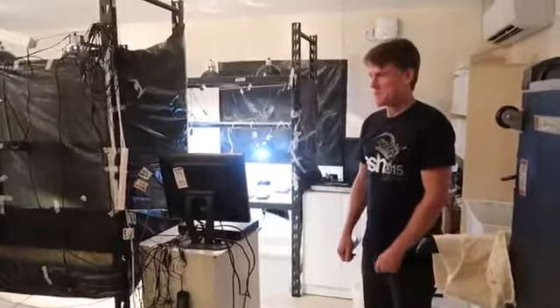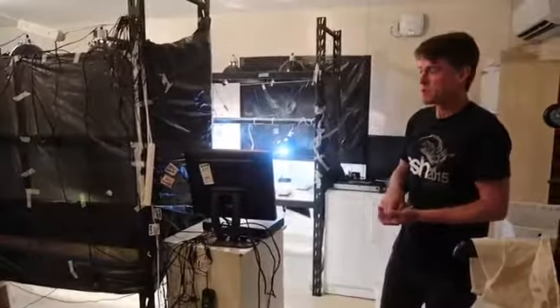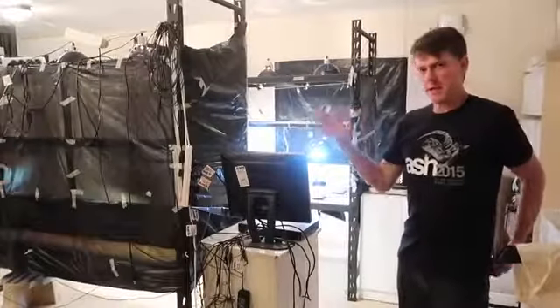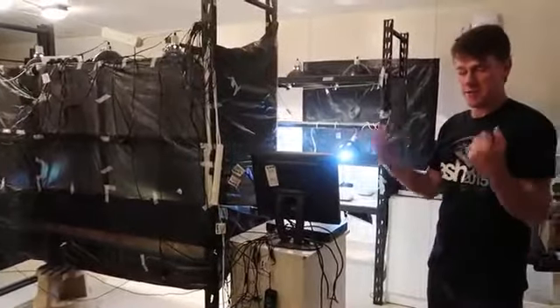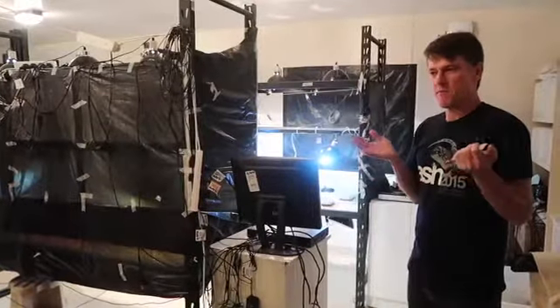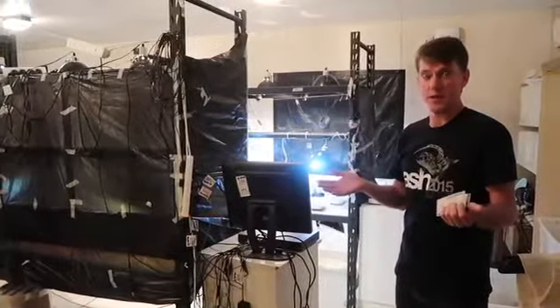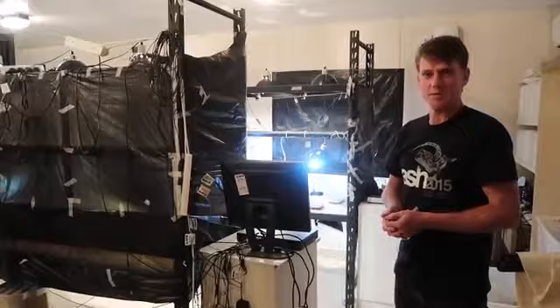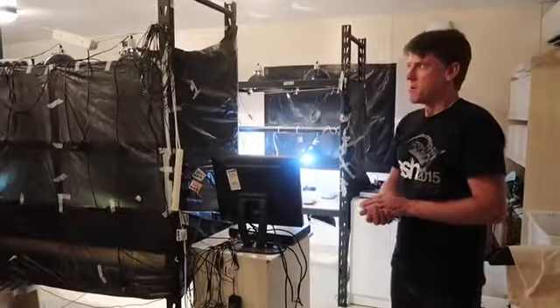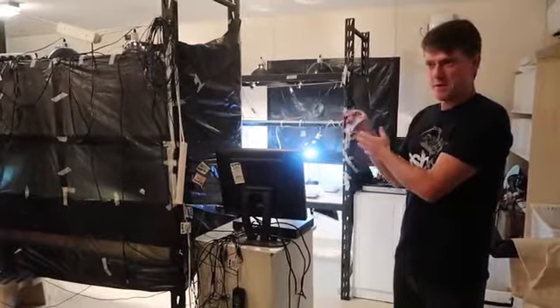So this is what we call the Cognition Center, which is a bit of a misnomer because we use this room for a lot of things. It was called the Cognition Center because we've got this big camera system which links to DVRs, and we've used it in a lot of studies on cognition and learning in lizards. But basically it gets used for a wide range of studies on animal behavior. The main feature is all the camera systems set up on all these shelves.